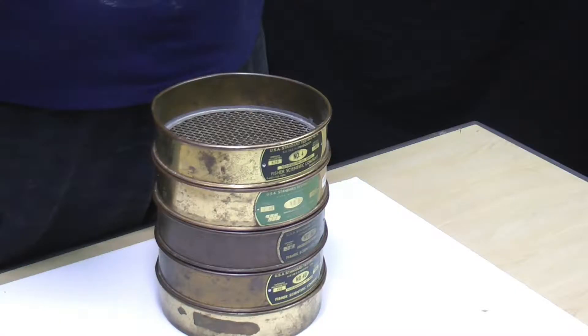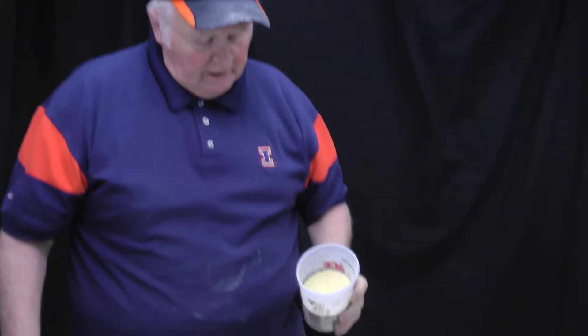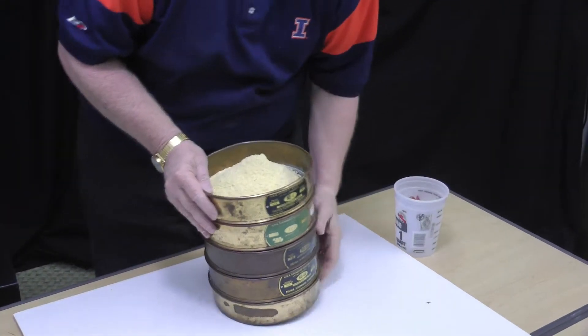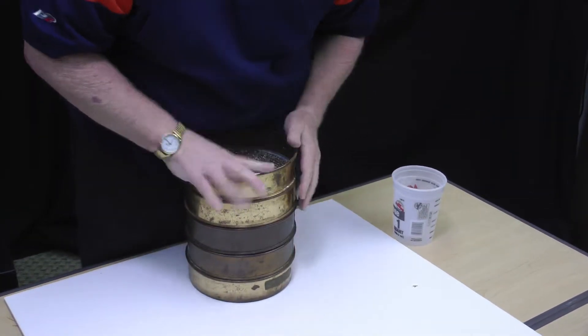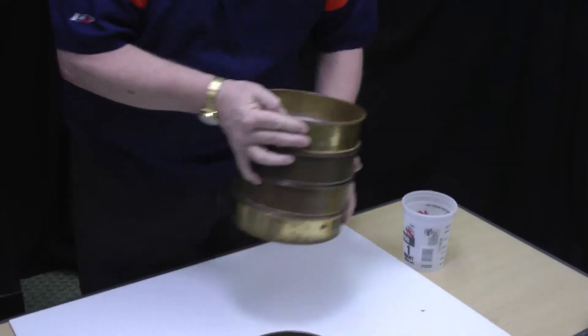We have our five screens stacked on top of each other. We will be adding about a cup and a half to two cups of dry ground grain that we're dropping into the screen, and we will then go ahead and shake that. You can either keep it flat on the table or hold it, since we're not too worried about shaking the particles vertically or horizontally.